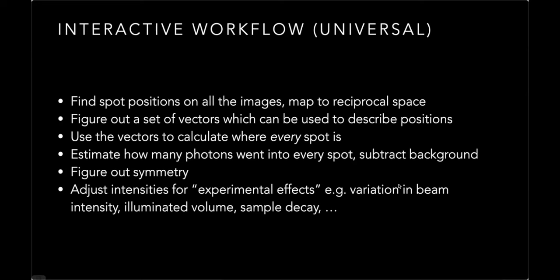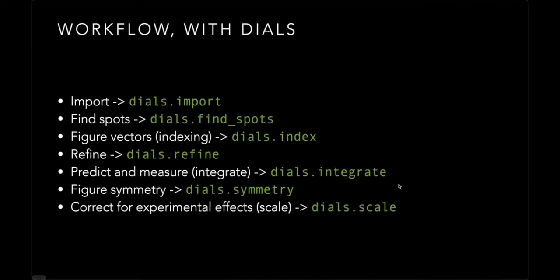So this is the same whether you're using DIALS or HKL or XDS or whatever. Now, if you're going through the same workflow with DIALS, actually, we don't have a lot of imagination. So when we come up with the different program names for the various steps, these are pretty descriptive of what you're actually doing. So we start off by importing the data, we do some spot finding, indexing, refinement, integration, and then determine the symmetry and scaling.